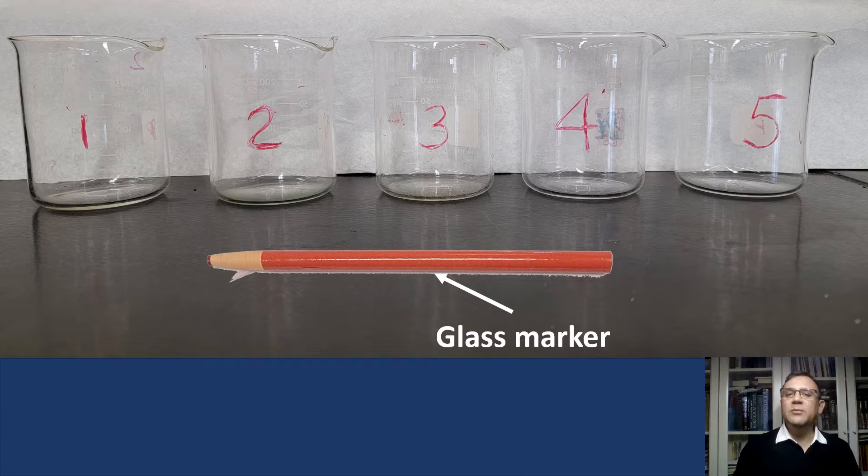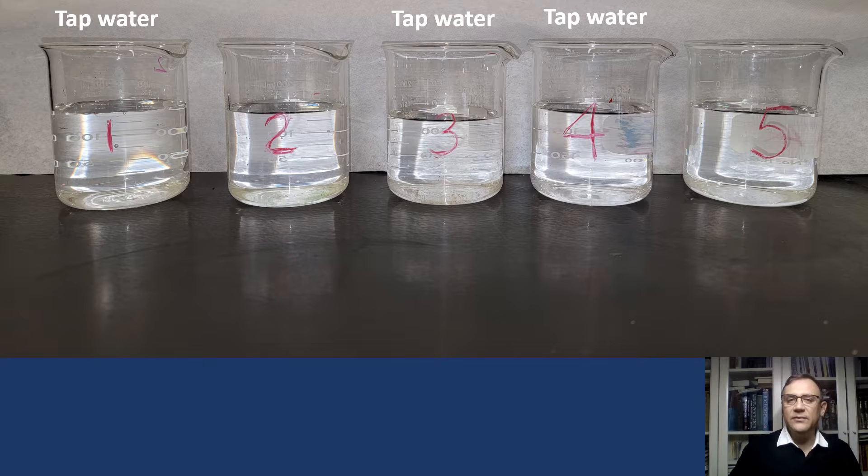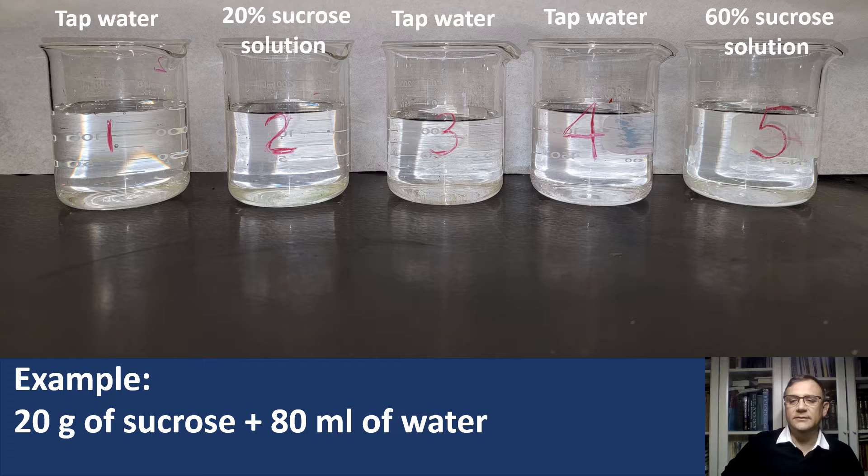First, we have to label five beakers for our experiment using a glass marker. I poured about 150 ml of tap water in beakers one, three, and four. In beaker number two, I poured about 150 ml of 20% sucrose solution.